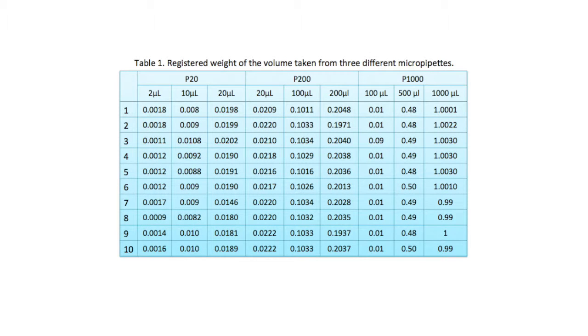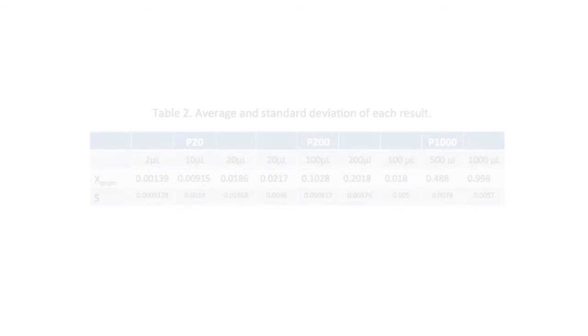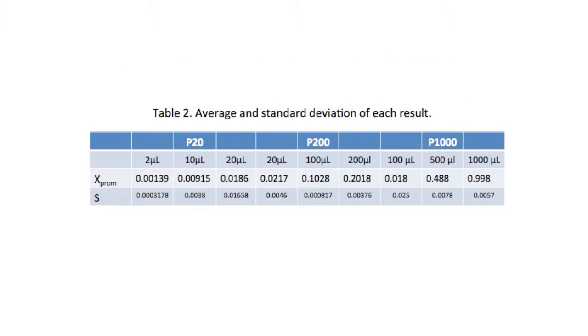For each sample taken, we registered the weight in order to know if we were taking the correct amount of water. For the same activity, we calculated the average and standard deviation in order to quantify the error.